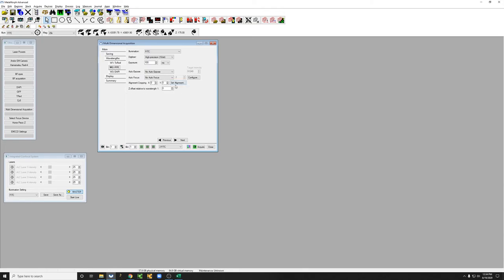So if you have a case where nuclei are very much in a sunny side up egg configuration, and you want to have nuclei to track the cells but also look at the base of the cell where it's attached to the glass, and those two things are in different Zs for the different channels that you're using to track them, know that there is a way to do that.